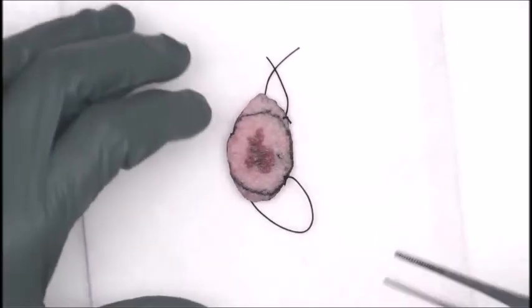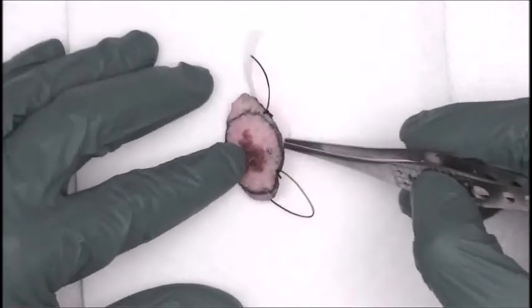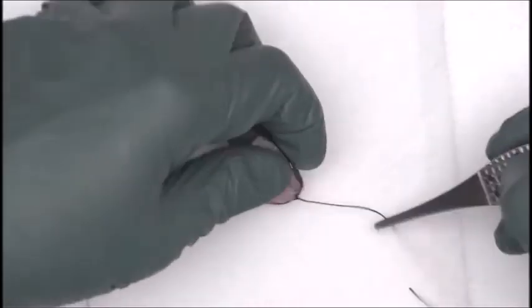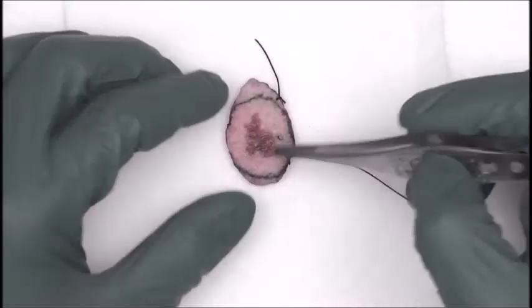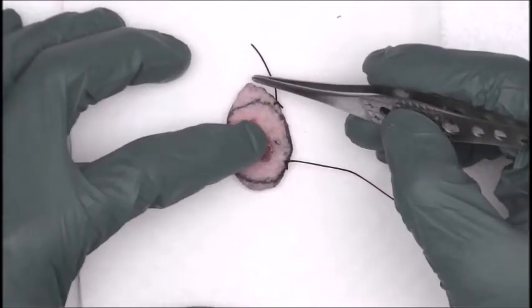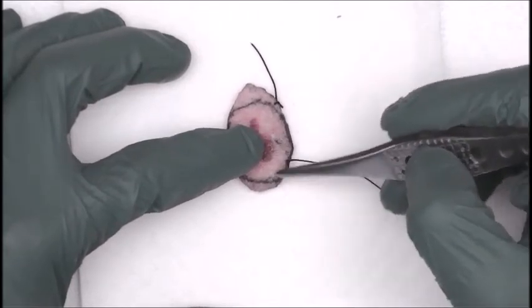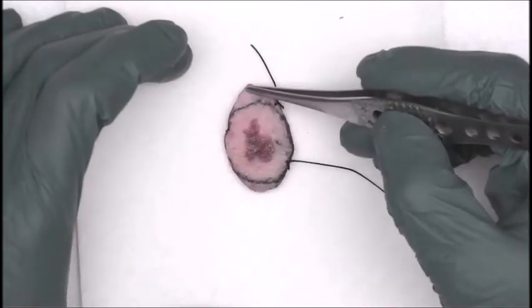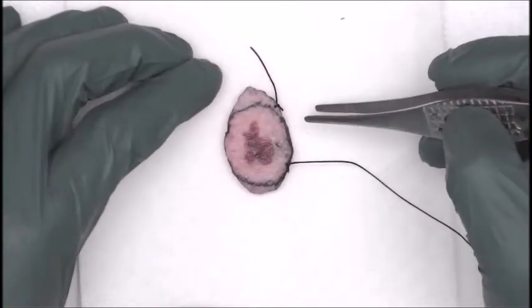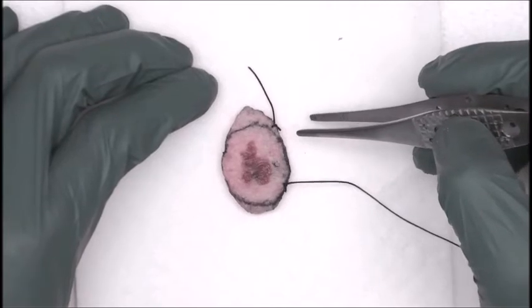So another way you can do it is you can do just one entire half. You don't have to do anything on the deep aspect. You can do the entire one half of the specimen one color, and the other half another color, okay? So there's 2 colors. Some places will have you do 12 to 3 peripheral skin soft tissue margin one color, and then 3 to 6 another color, 6 to 9 another color, 9 to 12 another color, and then do the deep aspect another color. So it just really depends on where you work and what your preferences are for your practice.